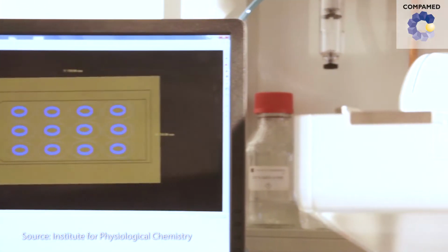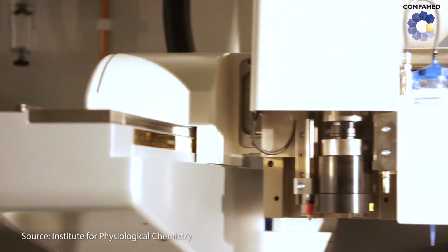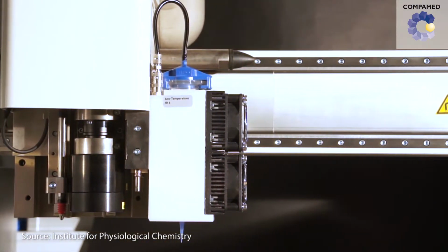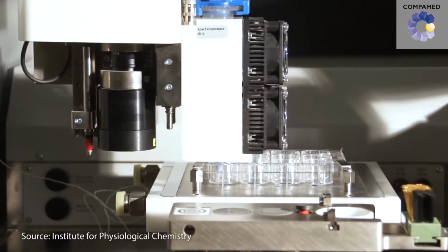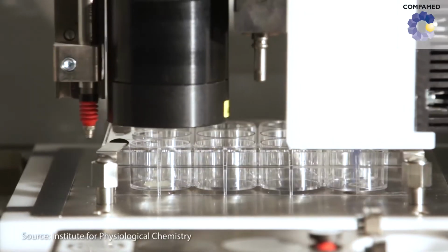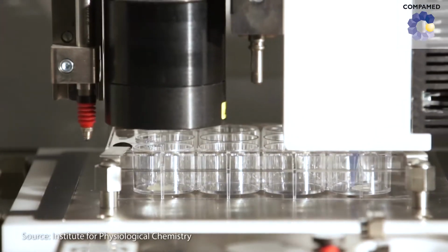Bioprinting has 2 advantages for medical technology. The production of a custom-fit implant requires the use of less material than is needed for fixed implants because the necessary components are built layer by layer using bioink. What's more, the used materials also promote a regeneration of defects inside the body.